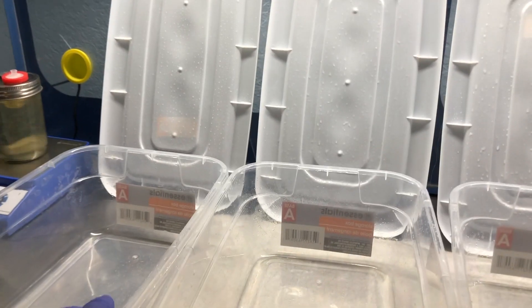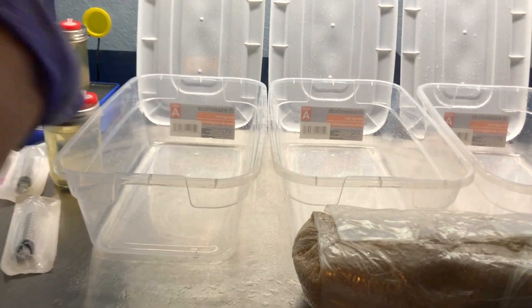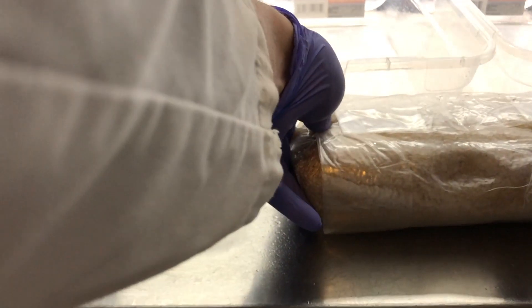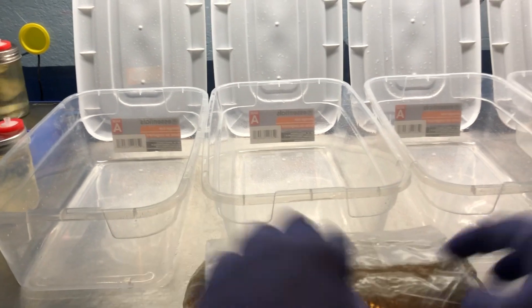I'm going to start with my single isolate colony and put rice in. There are a couple different methods you could use at this point. I'm going to try to just place my substrate into the tote and then inoculate on top. Another option would be to inoculate the whole entire bag, mix it around, and then put it in the tote. The only reason I'm doing it this way is because I only made enough bags to do the same oats.